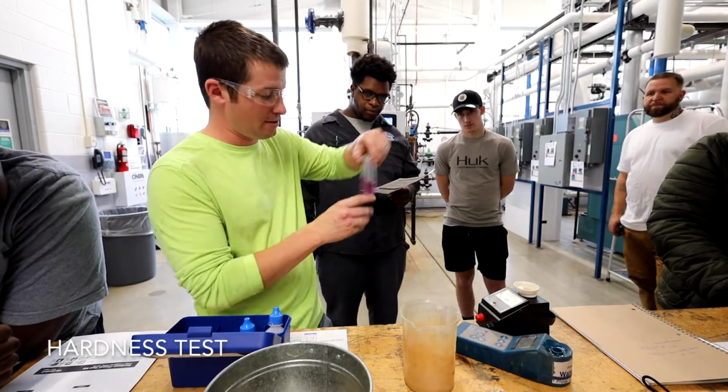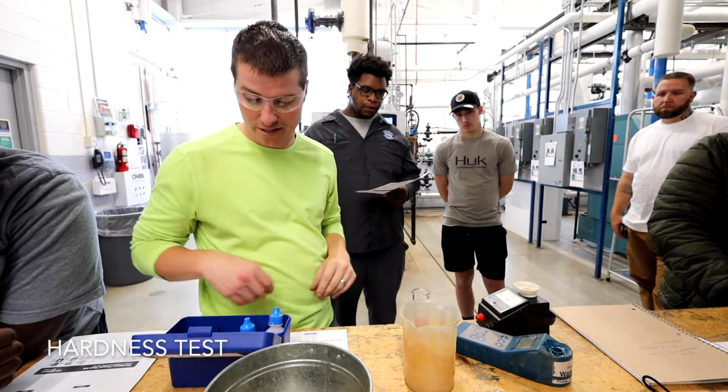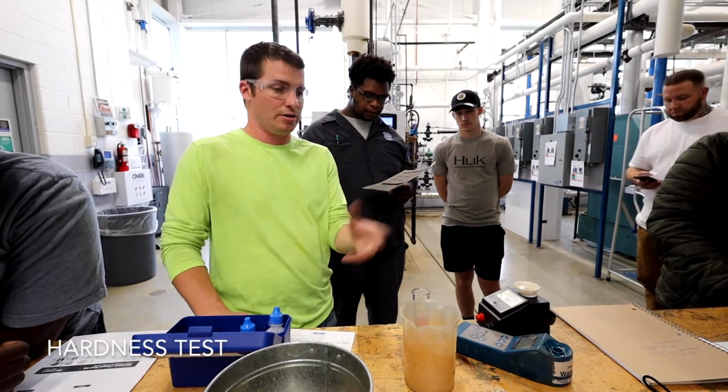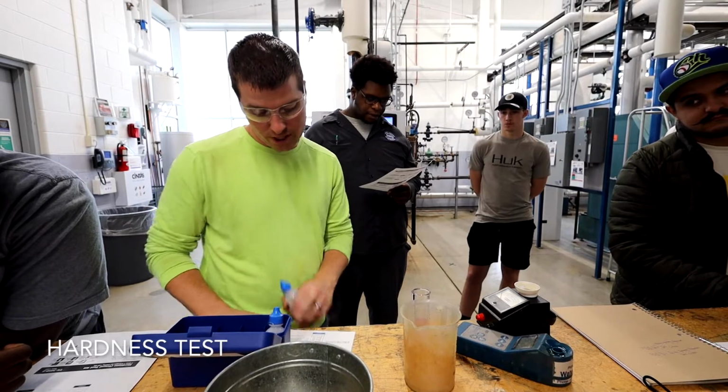Okay, so it's pink, right? I don't think that's red. I don't know why I say red. Maybe I'm colorblind, but that's not red to me. All right, so then we know we have some hardness. So if it turned blue, we would be done, and our answer is 0, and you write down a 0 and you move on. We, on the other hand, don't have 0. So we'll go to step 4.